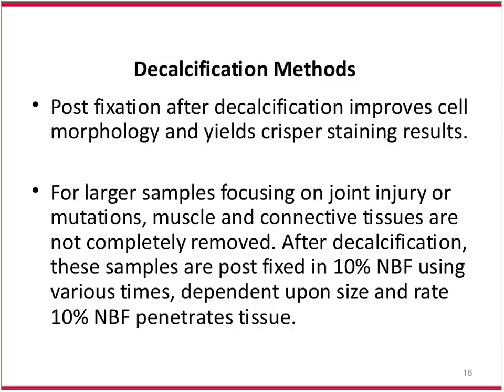So post-fixation is something that I'm big on. I post-fix many of our samples after they've been decalcified. In our hands, it improves the cell morphology and yields crisper staining results. I have seen it. I've had people say, well, we don't think that this is the case. And I don't have any real evidence other than that in our hands we have seen that it makes a difference.